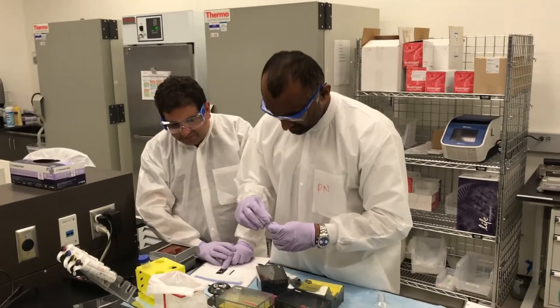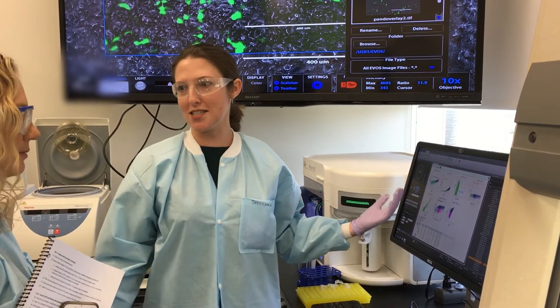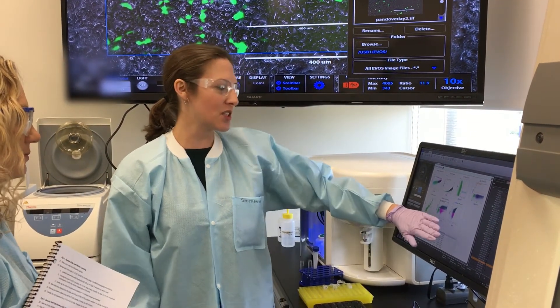The best thing about the workshop so far is doing hands-on work, because when you do it hands-on you can screw up and you always learn better when you screw up. And also having someone explain the nitty-gritty — this teaches you all the little things you should know.